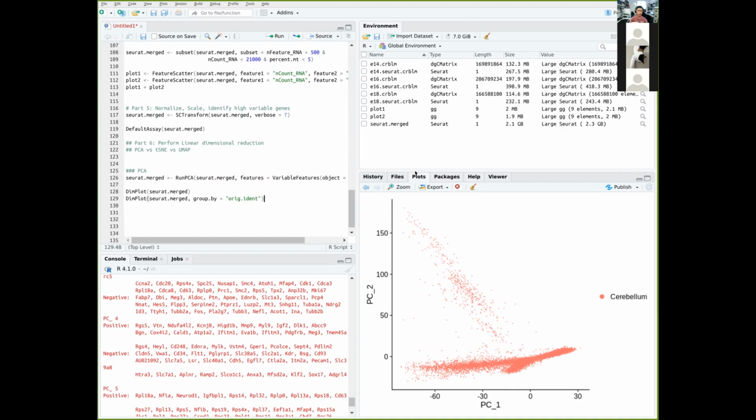It should be one of the reasons, because PCA, to put it in a simpler way, samples your data set and creates this plot every single time. So whenever you do PCA a couple of times, usually some things might be slightly different. The other thing could be that the scaling or the values of the gene expressions is slightly different, but I don't think that should differ because we are using the same count matrix, we did the same pipeline, and it shouldn't differ.